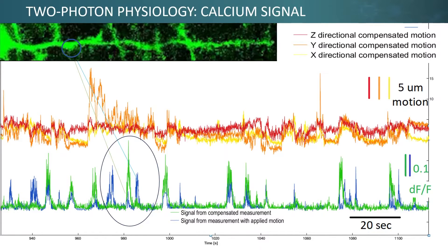Here we can see the stored movement curves. The X-directional movement is plotted in yellow, Y in orange, and Z in red. At the bottom of the page, calcium curves elicited from a dendritic spine can be seen. The green one shows the signal from the measurement with real-time motion correction. The stored motion was then applied on the dendritic measurement, and the signal elicited from a moving spine is plotted in blue. We can see that without motion correction, the blue signal missed some of the active periods and suffers from large artifacts caused by motion.